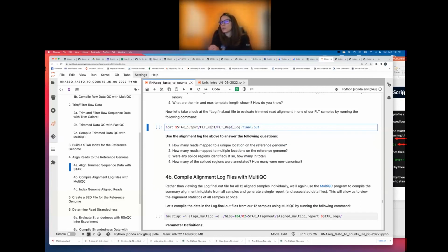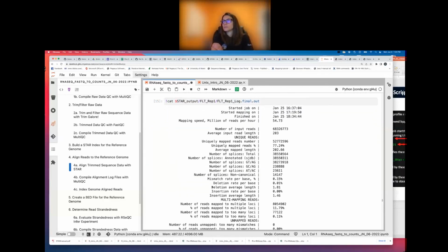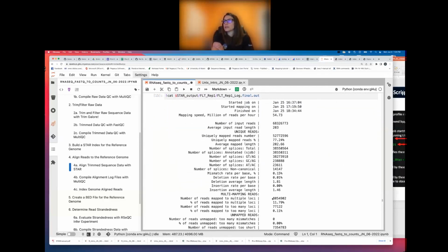And hopefully I'll probably cut you off after about a minute so that way we get through all these questions before we get into our break. So go ahead and run that command. And you should see something that looks similar to this.